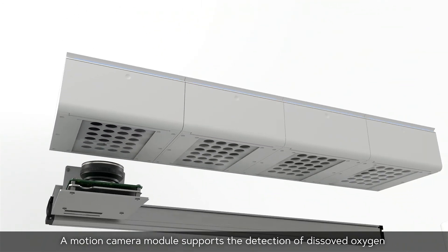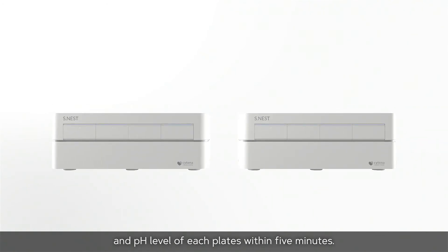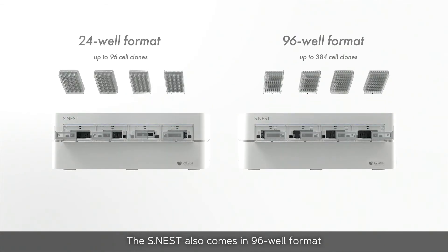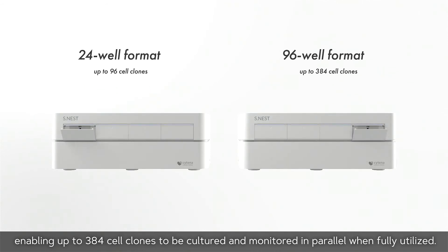A motion camera module supports the detection of dissolved oxygen and pH level of each plate within five minutes. The S-NEST also comes in a 96-well format, enabling up to 384 cell clones to be cultured and monitored in parallel when fully utilized.